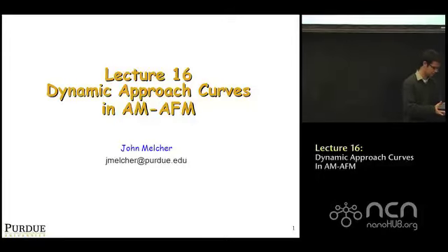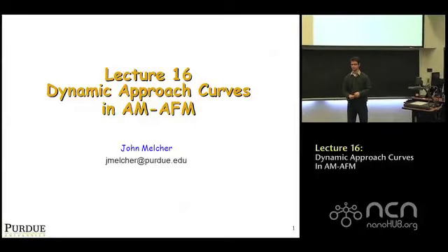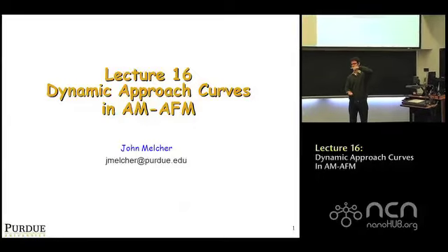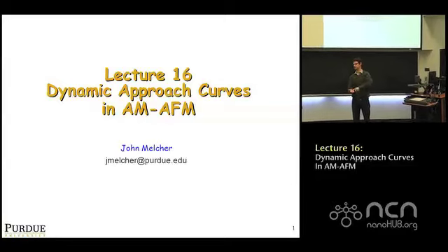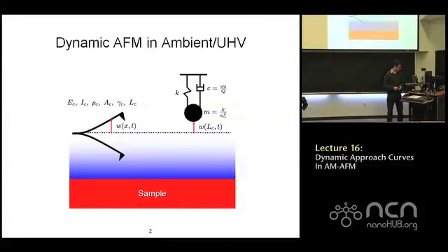So today, previously we looked at static force distance curves where the cantilever was quasi-statically approaching the sample. We weren't driving the cantilever to make it oscillate. So today we're going to look at what we call dynamic approach curves, and that basically means that the cantilever is vibrating while we approach the sample. Okay? And there are two simulation tools which are relevant to that experiment in VEDA.